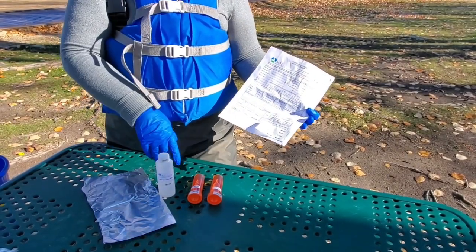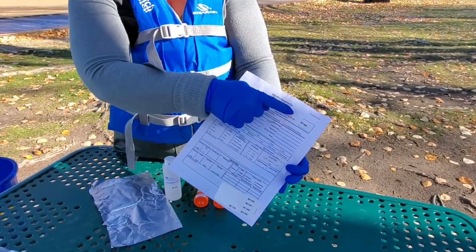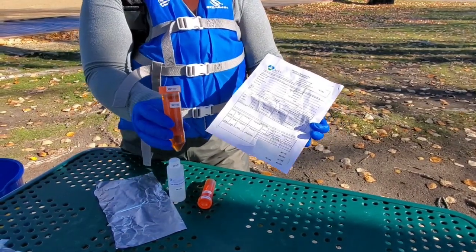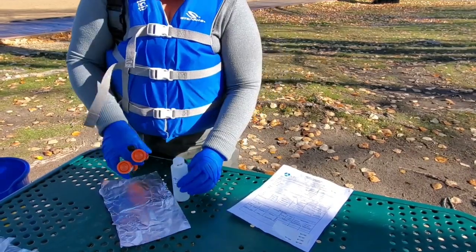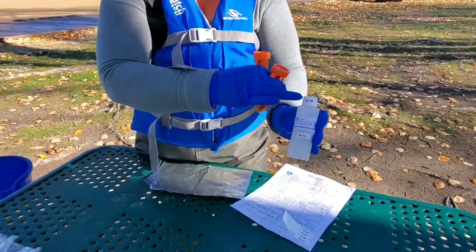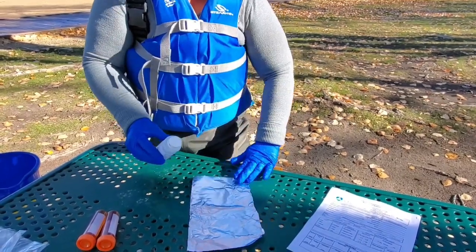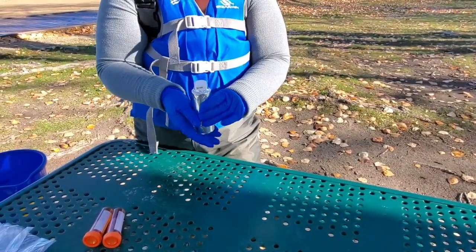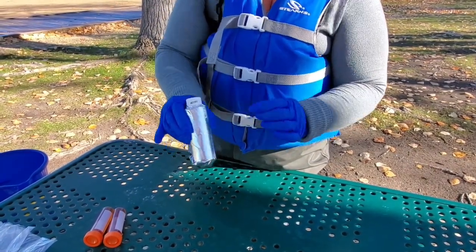Stick on a sample ID sticker from the requisition form to both the cap and the body of the bottle for all 3 bottles, and stick one in the top right corner of the requisition form. Wrap tinfoil around the ACFT bottle to protect it from sunlight. Place the ACFT bottle and the requisition form in a plastic bag, and the conical tubes in a separate plastic bag. Place all bottles in a cooler with ice packs and deliver them to your nearest local public health office.